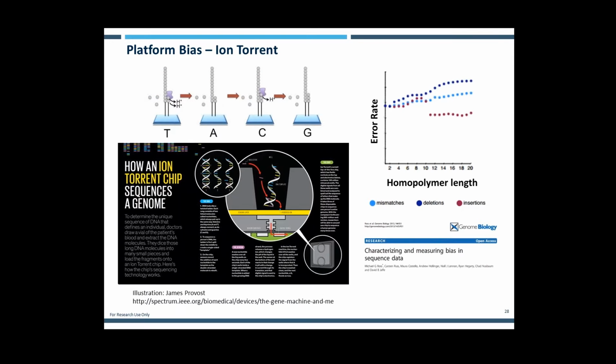And so when we consider Ion Torrent sequencing, we're again using sequencing by synthesis. And here fragments are prepared using emulsion PCR, again generating a clonal set of fragments, which are then deposited into a microwell on the sequencing chip. And rather than making use of labeled nucleotides and optics during the synthesis and detection, here individual nucleotides are flowed over the chip individually, again with the polymerase. And as the release of positively charged protons happens, these are electronically detected by a sensor in each of the wells.